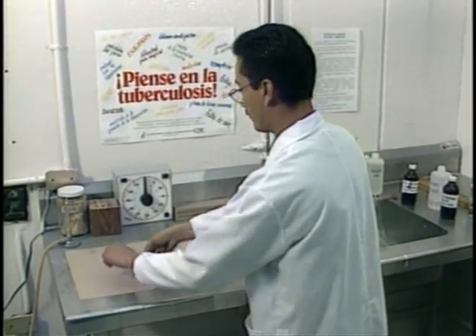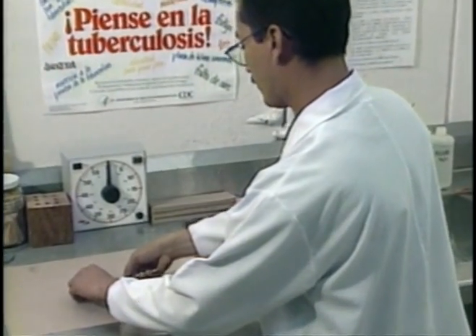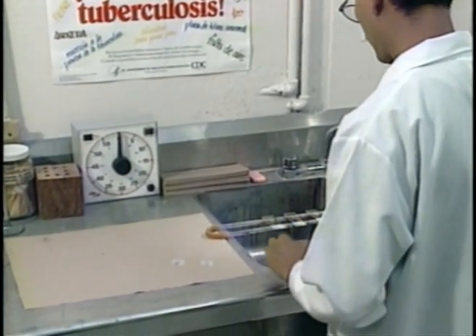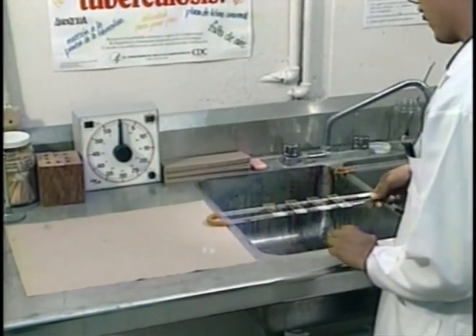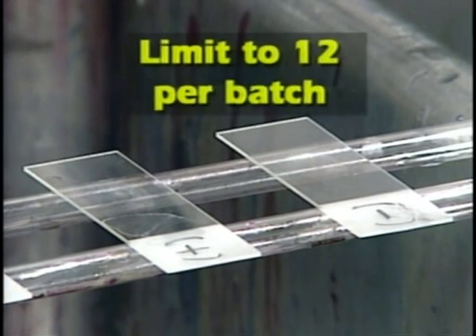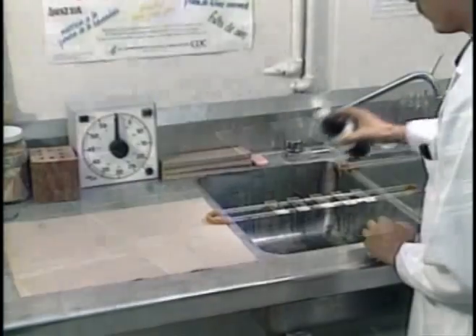Using forceps, place slides on a staining rack with the smear side up. Place all slides in uniform orientation. Slides must not touch each other. This avoids the possibility of stain running over and causing cross-contamination. Include a positive and negative control slide daily for quality control purposes. Never stain more than 12 slides at a time.